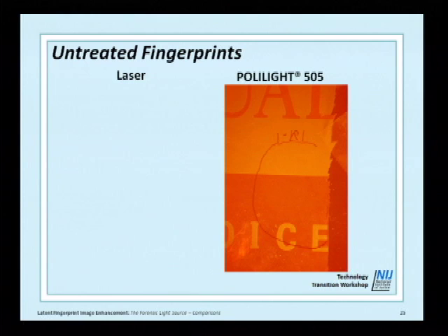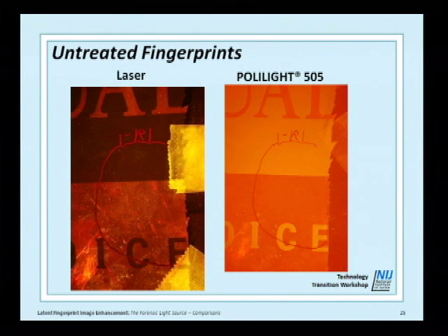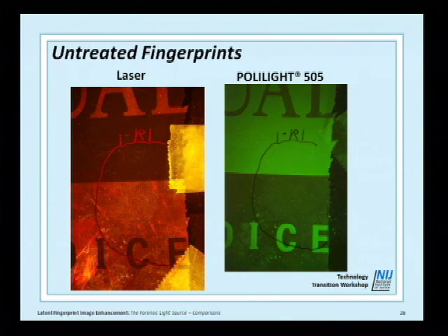This is a little better example maybe. This is polylight. Can you see ridge detail on the left? Okay. And this is application of a narrow bandpass filter.